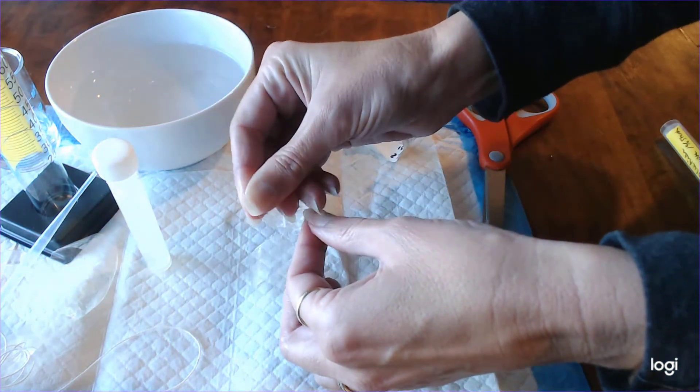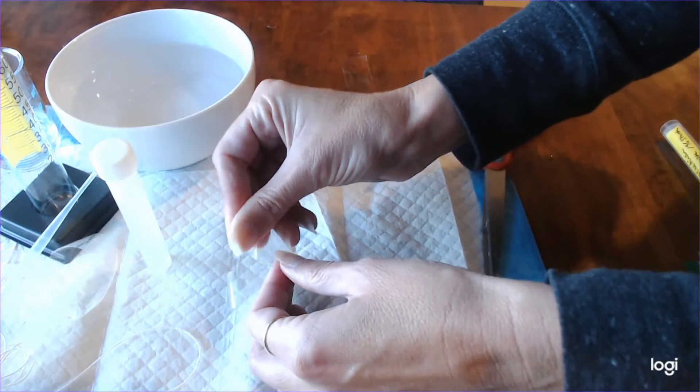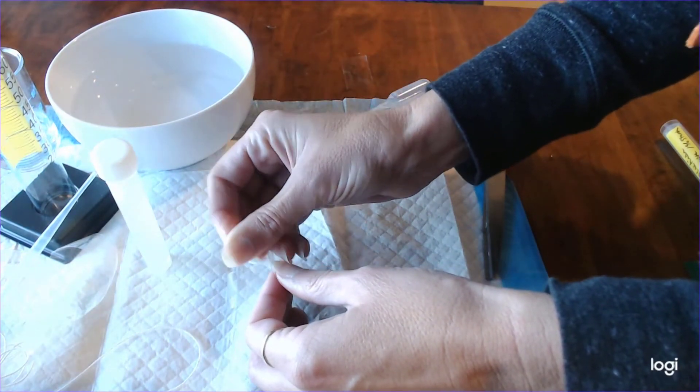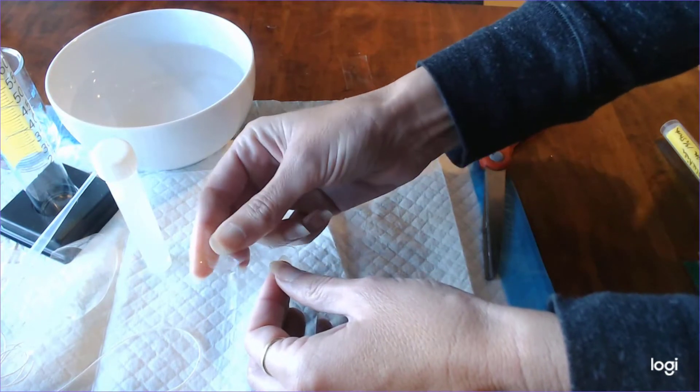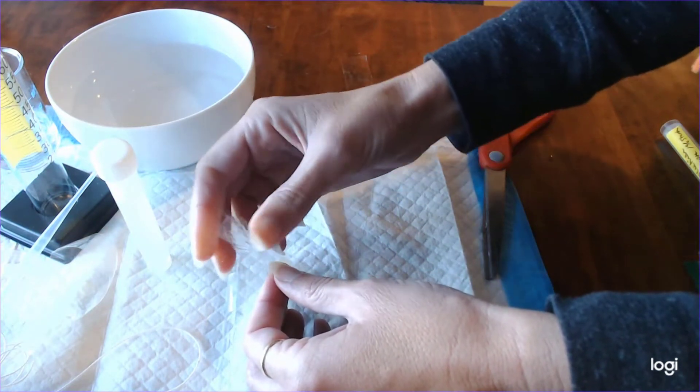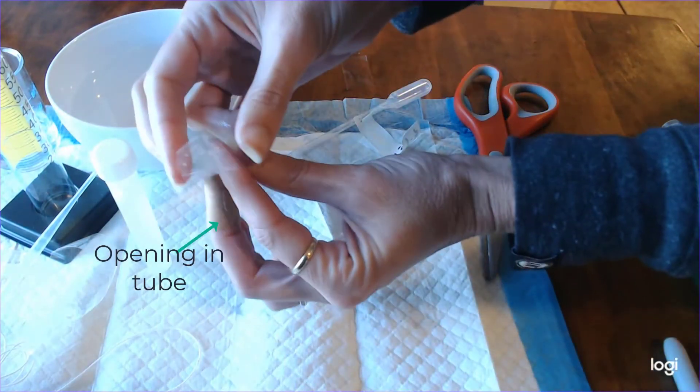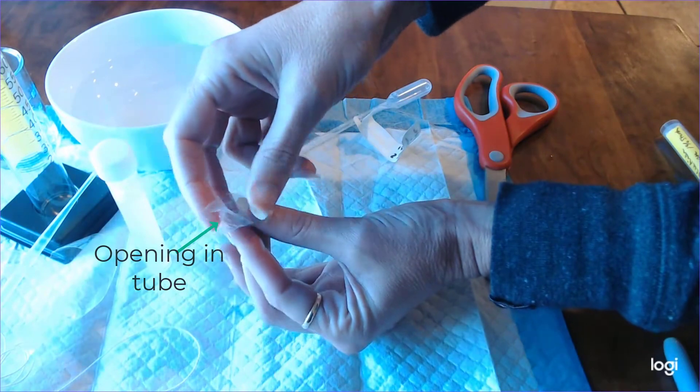And then what we're going to do is take our fingers and basically roll the tubing, one end of the tubing in between our fingers, over and over and over again until eventually the tube separates. So it takes me a little bit of time, some people are faster, but once it separates you can kind of see right there the opening of the tube.